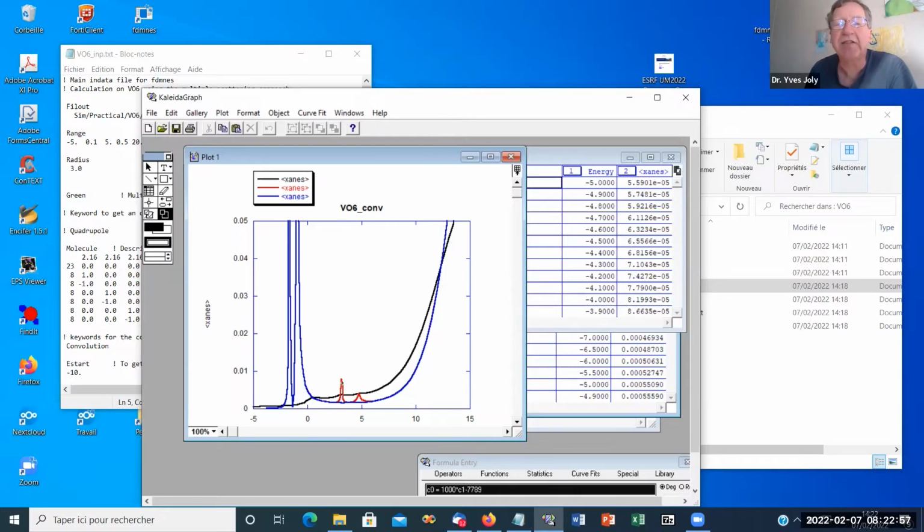And because here it's 3 states times 2 because of the spins, it's more or less 6 places, if you want. And here it's only 4. So that's why this one is bigger than this one.